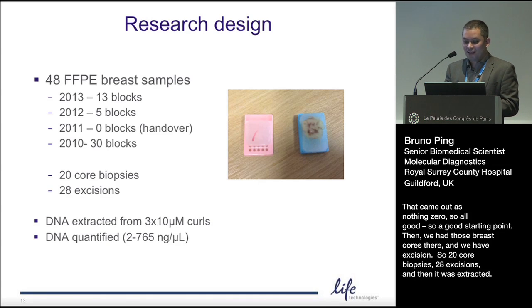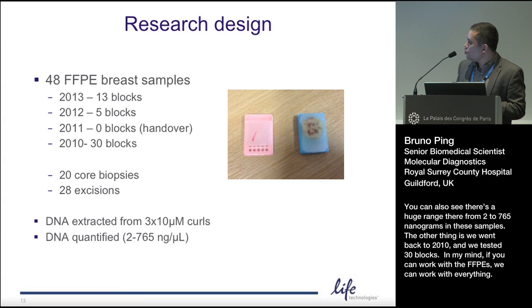And then we had those breast cores, and we have excisions. So 20 core biopsies, 28 excisions, and then it was extracted. And you can also see there's a huge range there, from 2 to 765 nanograms in these samples.